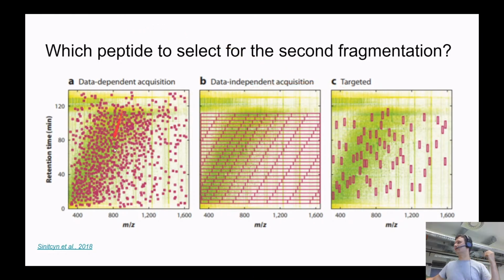You don't want to do this data-dependent acquisition, like discovery proteomics, when you don't have some focus and you're just searching for all possible proteins. You're really focusing on these specific 60 peptides, and you have very reliable quantification of these 60 peptides, and as a result, 15 proteins. We don't have any missing values. You don't need to come up with some dramatically complicated imputation method. You can really just use targeted proteomics and have very reliable quantification of these peptides.